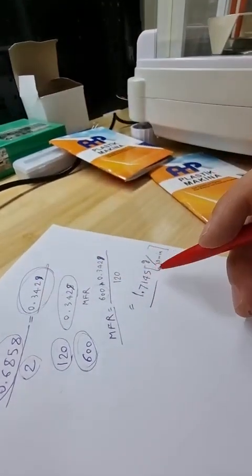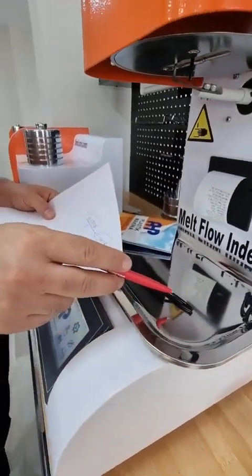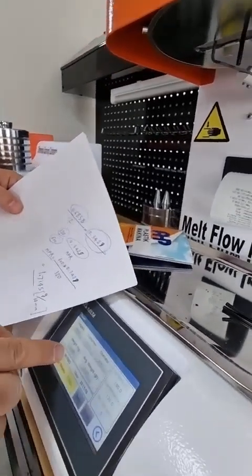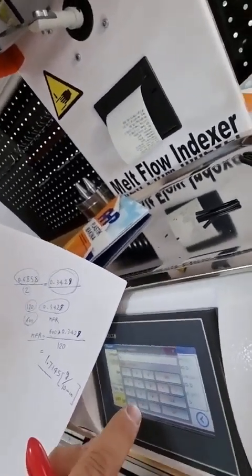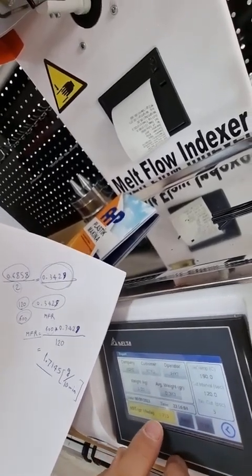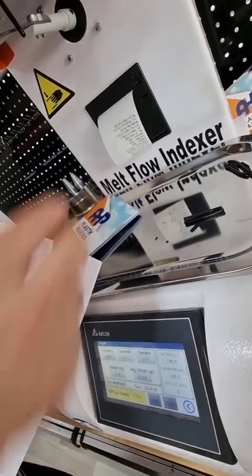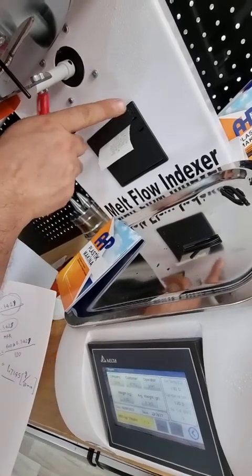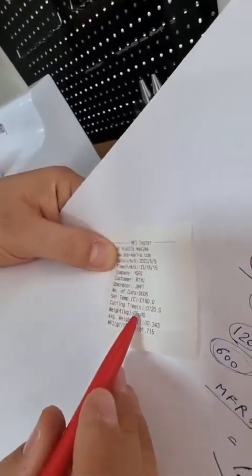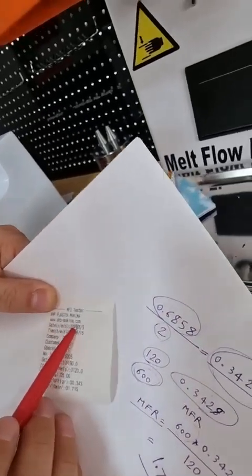The machine is also able to calculate the melt flow rate from the average mass of the cut pieces. The average weight for two pieces was 0.3429 grams. Entering this average weight into the machine gives a melt flow rate of 1.715 g/10 min. You can print this result, showing the melt flow rate, the weight used (5 kg), and all other parameters including customer, operator, and time.